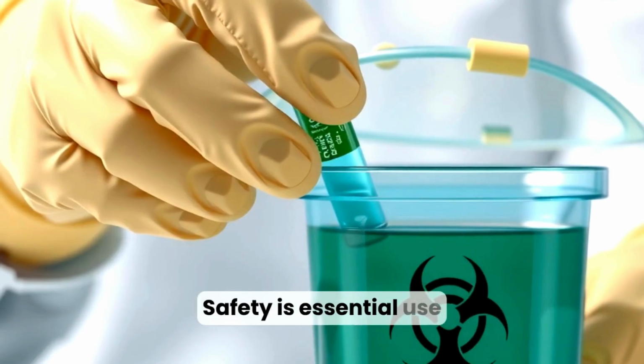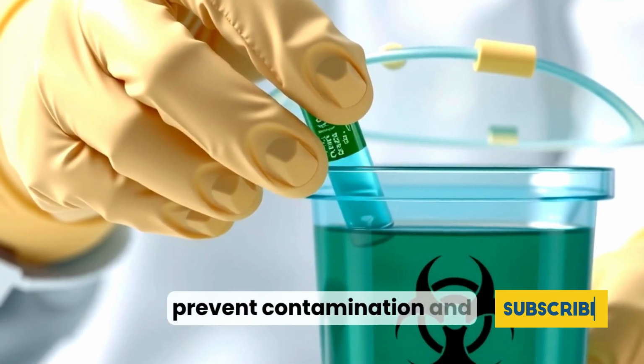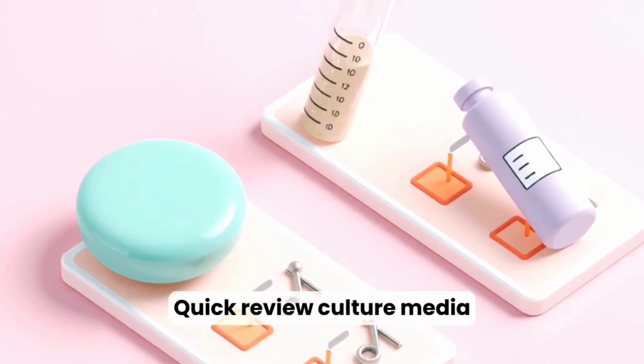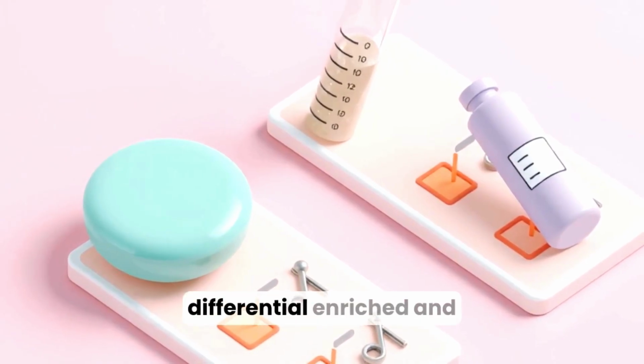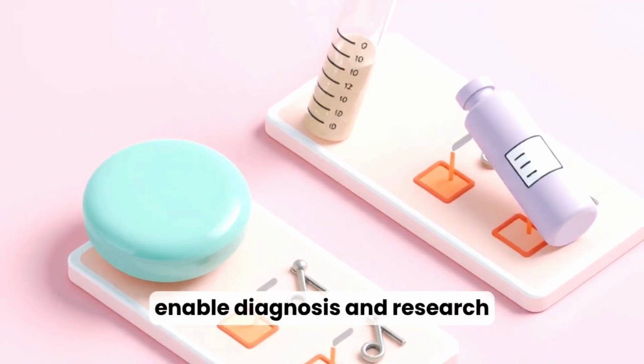Safety is essential. Use aseptic technique, proper disposal, and containment to prevent contamination and exposure. Quick review. Culture media provide nutrients, come in types like selective, differential, enriched, and enable diagnosis and research.